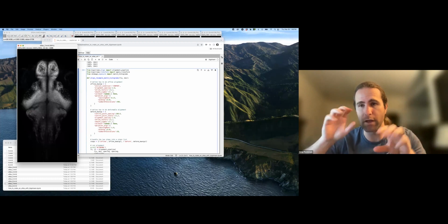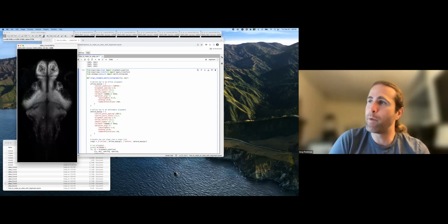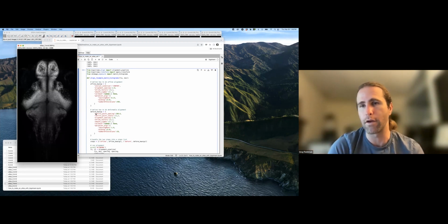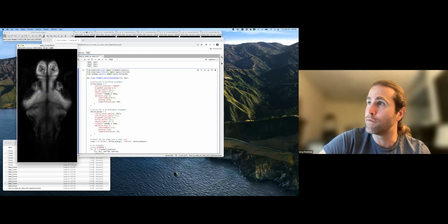And they're huge compared to other cells in the zebrafish hindbrain. They're really big somas. Those cells are so big and in sufficiently consistent locations that you can register them together in an atlas and have them show up. But your choices for how you do the affine and the deformable alignments would have to be good enough to make sure that the registrations done in each round could put the Mauthner cells correctly on top of each other in each one of those rounds. But still, even at this lower resolution, we still have a pretty single cell resolution looking texture in the data, which means we haven't completely lost the single cell nature of the individual samples.